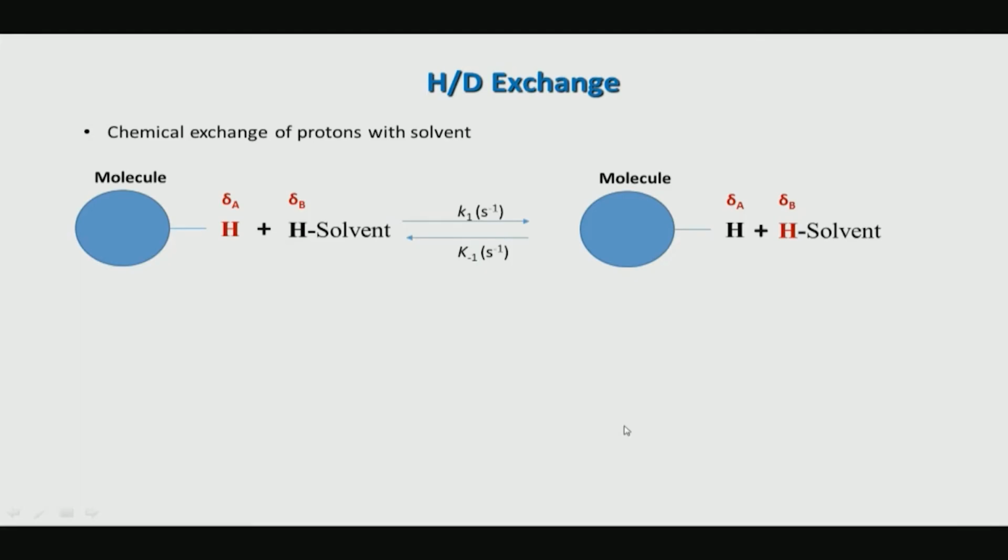So, now let us note the next topic, which is again based on chemical exchange, what is called hydrogen deuterium exchange, HD exchange for short. And this is a very routine measurement which is done on many peptides and proteins, because it helps us to tell whether that particular hydrogen is involved in a hydrogen bond or is exposed to solvent and so on. So, what is done in a hydrogen exchange?